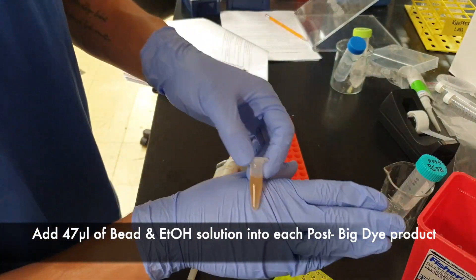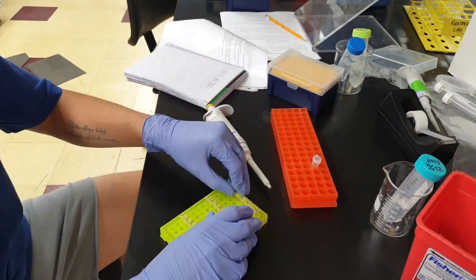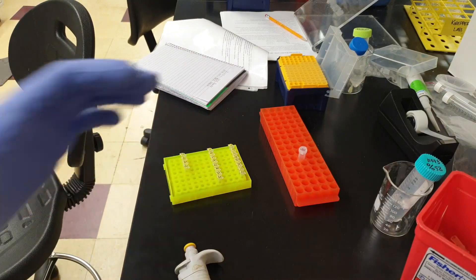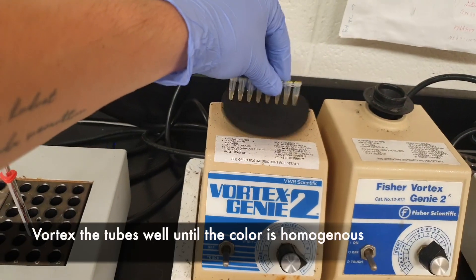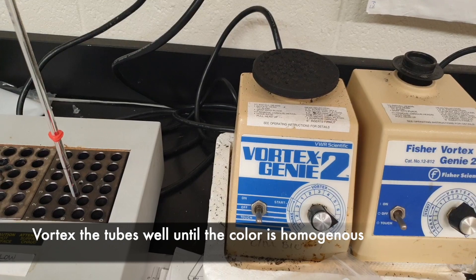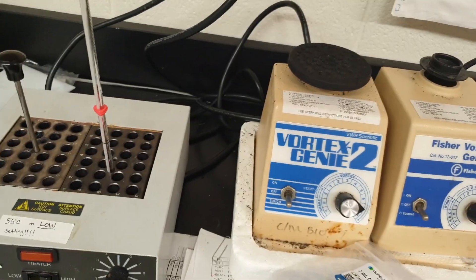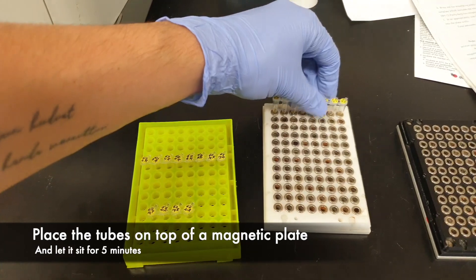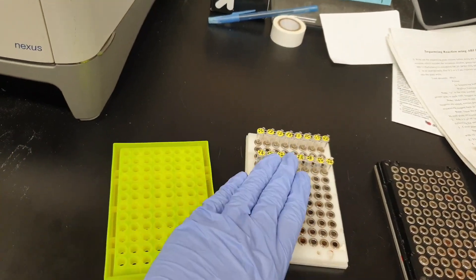Next step, we'll be adding 47 microliters of this master mix product into each of these tubes. Don't forget to change the micropipette tip every time. Once that's done, mix them well. Now we're going to place these on top of the magnetic plates.